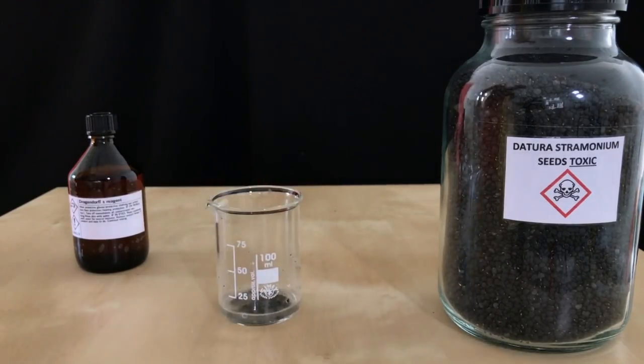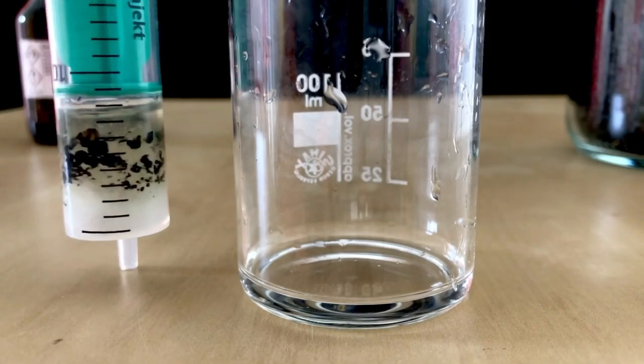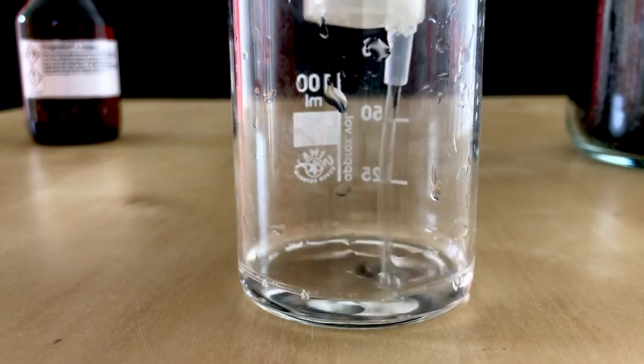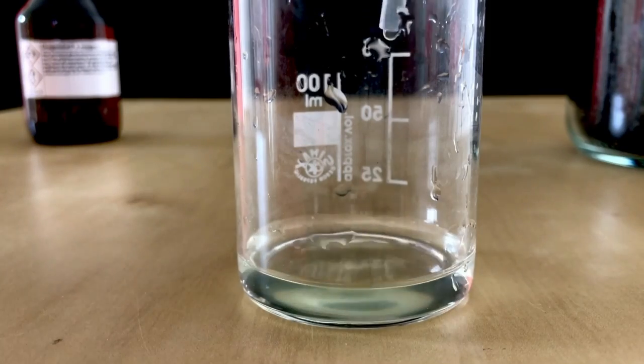Before proceeding we need to get all of the small chunks of crushed up Datura seeds out of the solution. Therefore a syringe filled with some cotton was used to get rid of the contaminants.